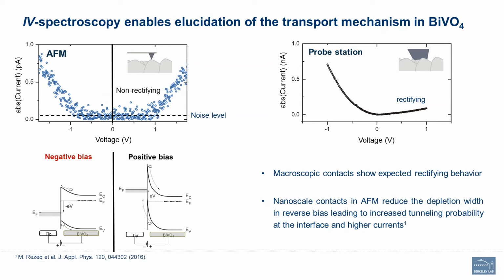Okay, yeah. Thank you very much for that clarification. Now you alluded to the influence of water, and that goes in an interesting direction. Maybe it would be very interesting to see what this measurement looks like in situ, in liquid. Would it be possible to make these measurements in liquid or even under photoelectrochemical control? So Francesca published, I think in 2016, a paper about the electrochemical measurements of BiVO4 using the Bruker electrochemical cell.